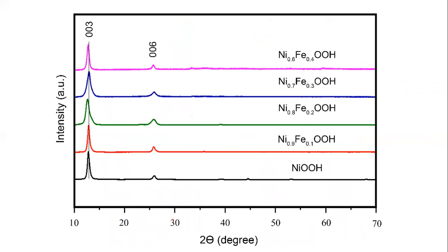When you look at here, just now I have told you that there was nickel OOH, and then I incorporated iron 0.1, 0.23. So when you look at this spectra, if you remember my previous discussion, these are all sharp peaks. This is a sharp peak. This is a second sharp peak. I can easily understand. The two are very sharp peaks and common everywhere.